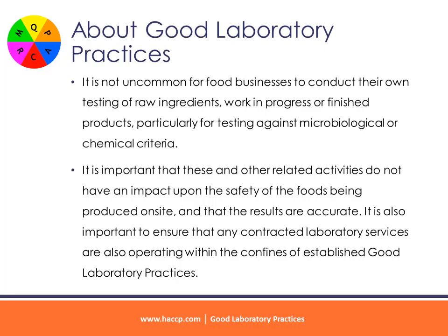About good laboratory practices. It is not uncommon for food businesses to conduct their own testing of raw ingredients, work in progress or finished products, particularly for testing against microbiological or chemical criteria. It is important that these and other related activities do not have an impact upon the safety of the foods being produced on site, and that the results are accurate.